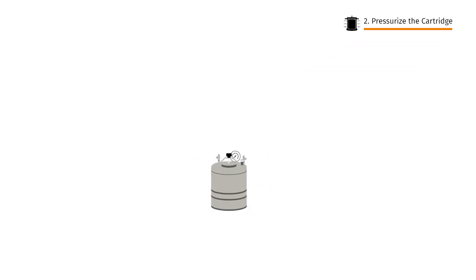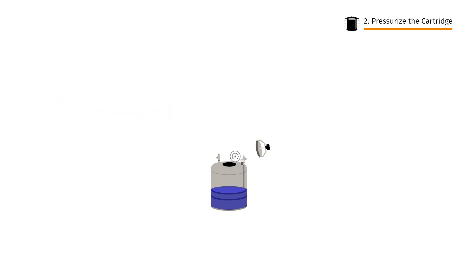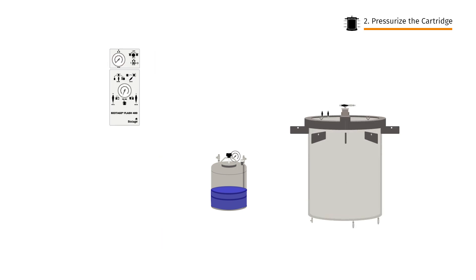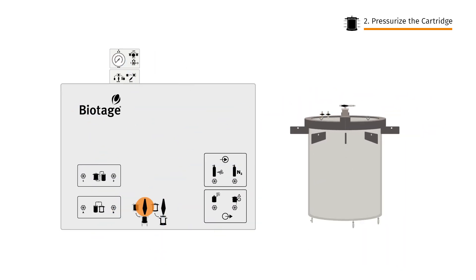Now let's prepare the compression module. Fill the compression fluid reservoir with about 10 litres of liquid. Isolate the cartridge by closing the cartridge compression valve, the valves on the compression module head and the two valves on the side panel.